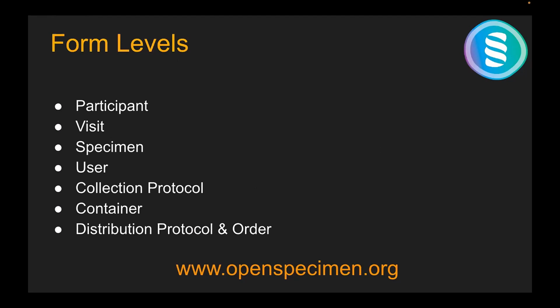If there are any SOPs, ethical committee documents, approvals, background checks, anything to do with users, all those can be created within forms and attached at the user level. Similarly, you can attach forms at collection protocol, container, distribution protocol, order. So in short, in all levels of OpenSpecimen, you can attach these forms.